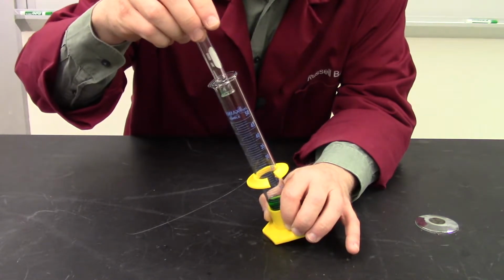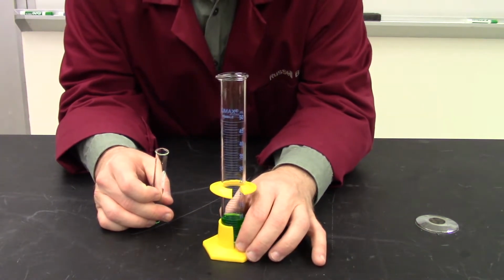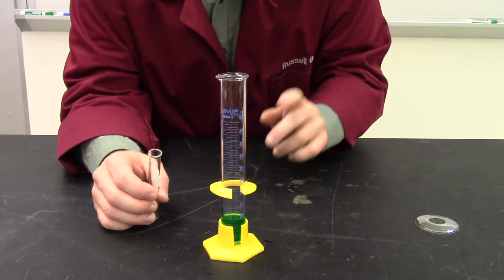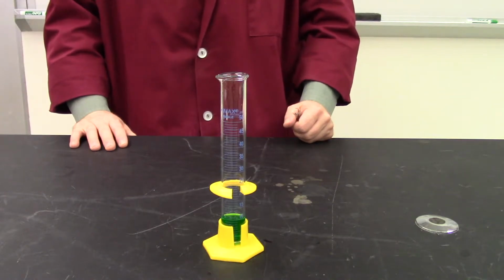And look at that last little drop. There we go. So now the next thing you see will be the meniscus of this device. Don't forget to read it to the proper number of significant figures. Also, don't forget to use the proper units.